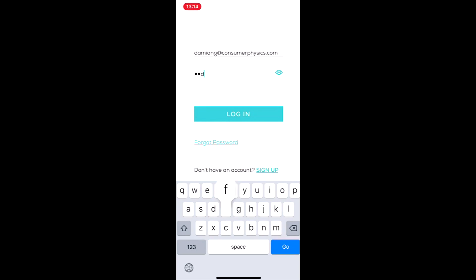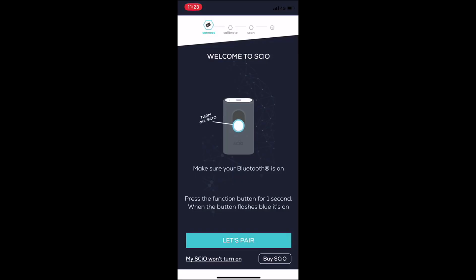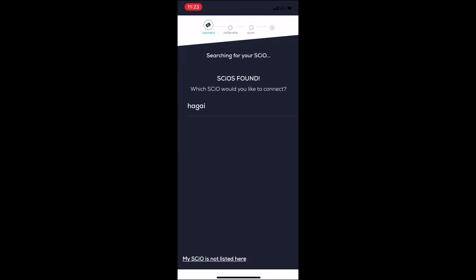The first time you log in, you'll start going through an onboarding process. The first step is pairing SCiO with your phone — simply follow the on-screen instructions to do so.